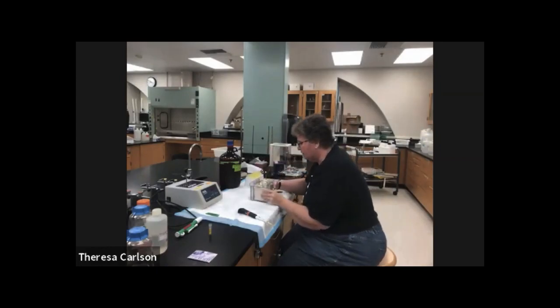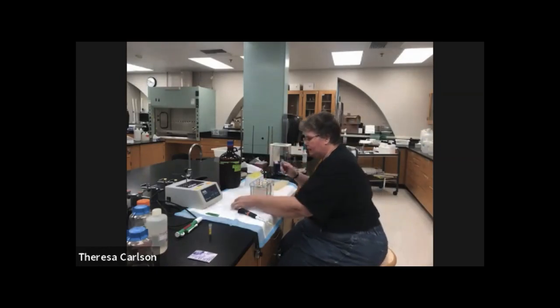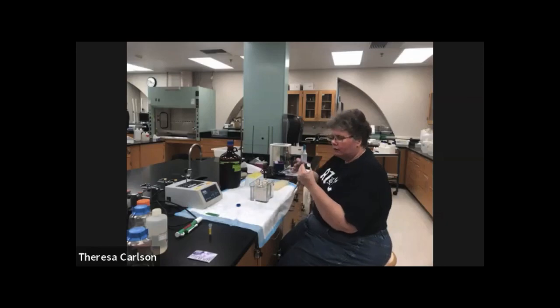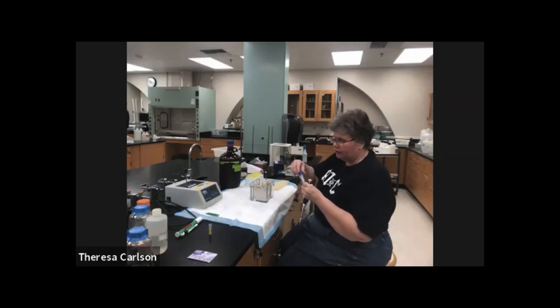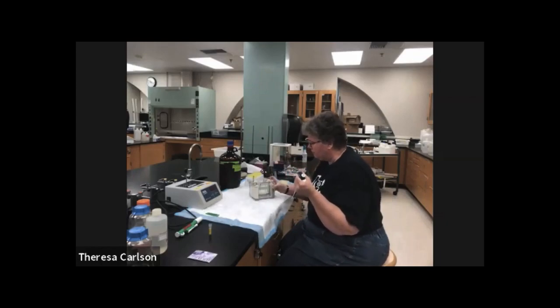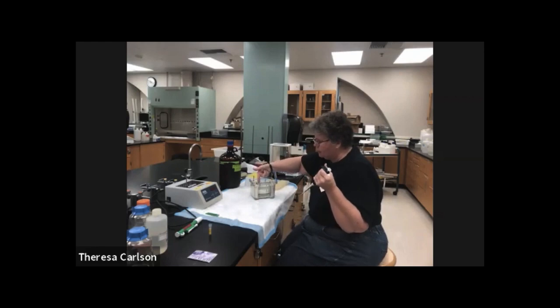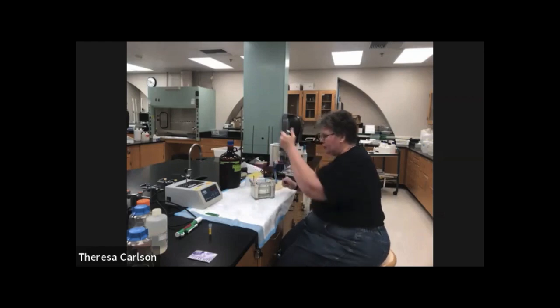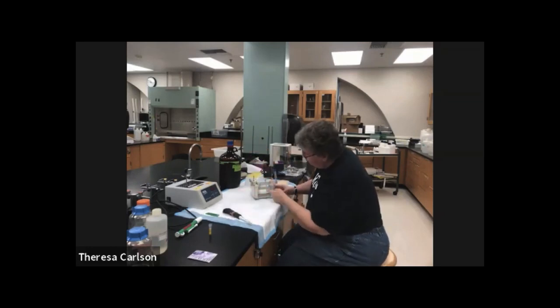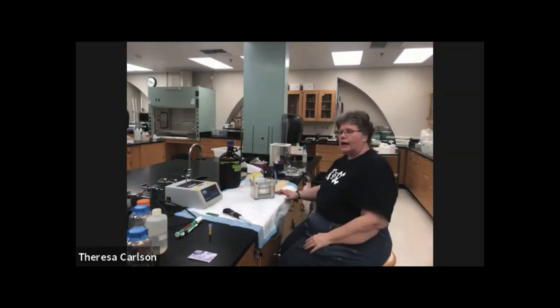And what I like to do is take a little bit of my 2x sample buffer, not a lot, just 8 to 10 microliters of the sample buffer, very, very small amount. And I go through here and I place my pipette on the smaller of the two plates and I just go down all along here, depositing a little bit, a little bit, a little bit without regard to where the wells are. And the reason I'm doing that is then it falls into the wells and will outline the wells for you.